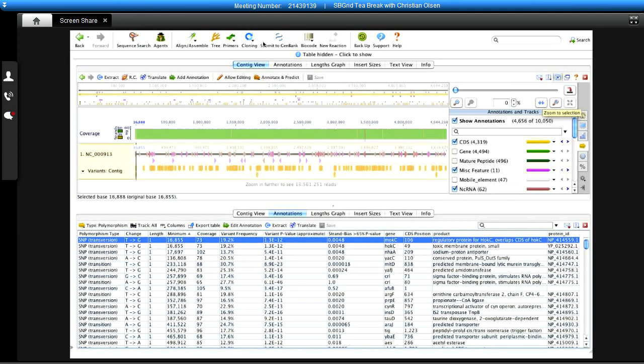You can change the view so that you can march through or work through your variants to sort your variants. So in this table that I have set up, you can sort your variants based on variant frequency, or if you want to look at strand bias, if you want to look at a particular set of changes, if you just want to look at transversions or insertion deletions, you can sort according to that. And we've made this so that you can throw out your false positives and drill down to the more likely variants. You can also export this as a table to import in downstream tools if you're using R, for instance.